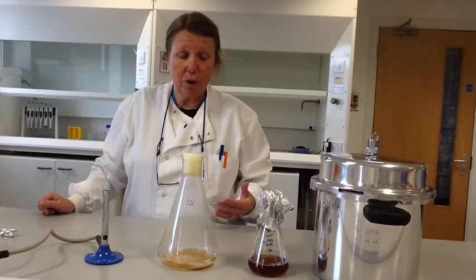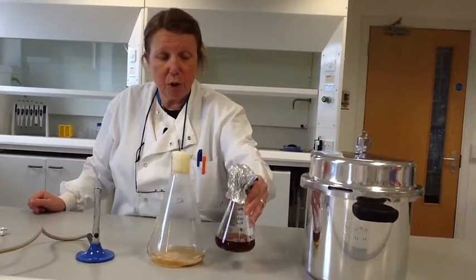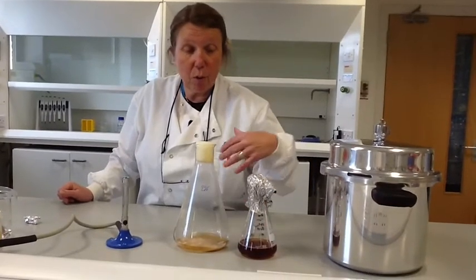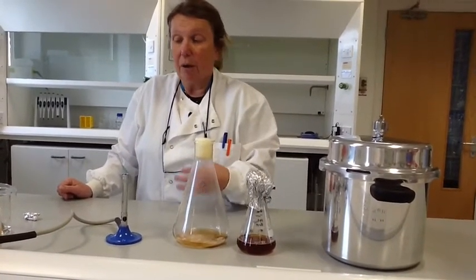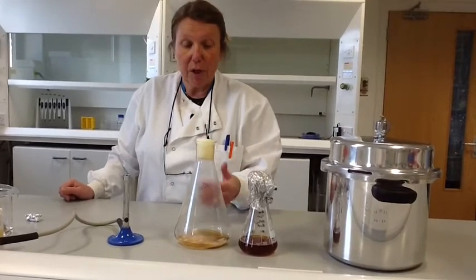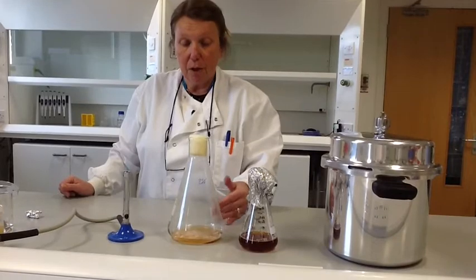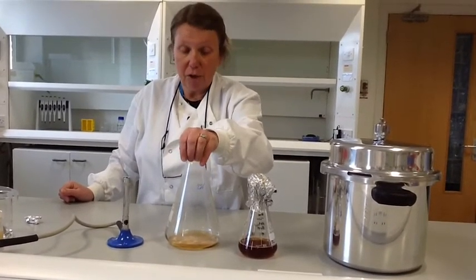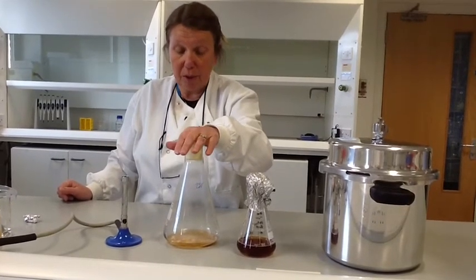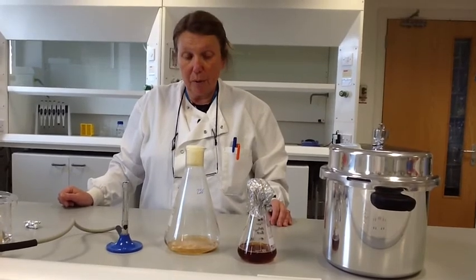It is microbiology — as soon as we've got a nutrient medium and start opening the top, it's no longer sterile. Once we've taken the bung out it's no longer sterile, and if we're not very experienced there is a chance of contaminating the culture. Therefore students should under no circumstances open the cultures at this stage, but you can still complete the experiment by drying the liquid and measuring the biomass.